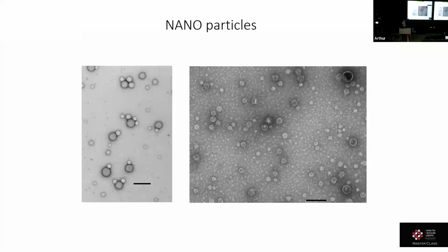On the left is regular lipid nanoparticles, and you can see that there is some structural damage with those particles as they've dried down. The structure has collapsed a little bit. You think of it as like a collapsed beach ball, and stain collecting in those wrinkles of the collapsed particle. But you can still gain a lot of information that you're going to need before going to cryo. You've got clean samples, evenly, homogeneously dispersed, and you could do that with different samples.